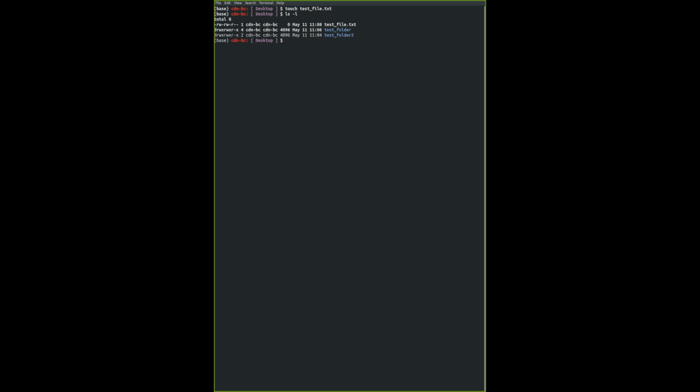Okay, I'm going to create a couple more. I'm going to create maybe 2 more with a different naming, and then with this.